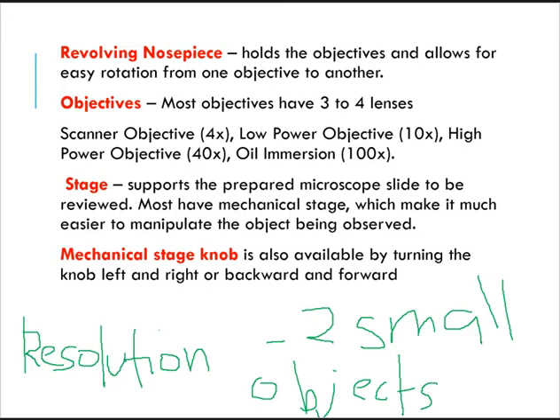Now for your stage, it supports the prepared microscope slide to be reviewed. Please highlight that one: it supports the slide to be reviewed.